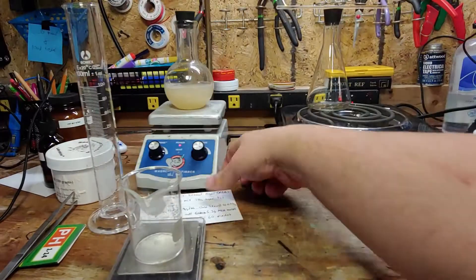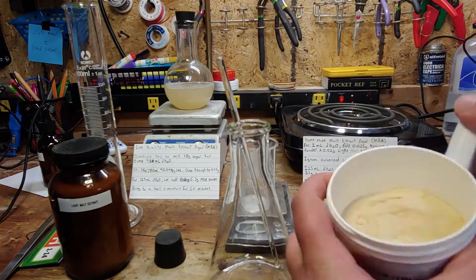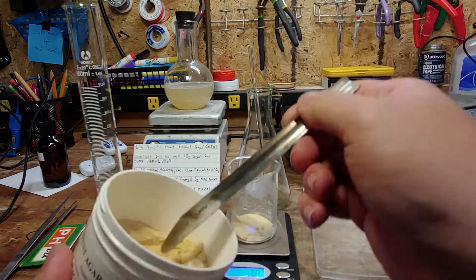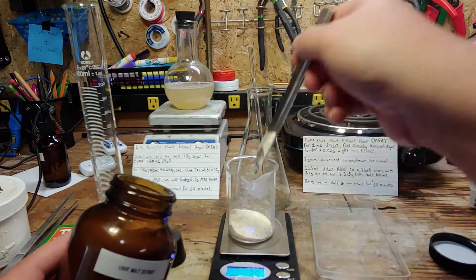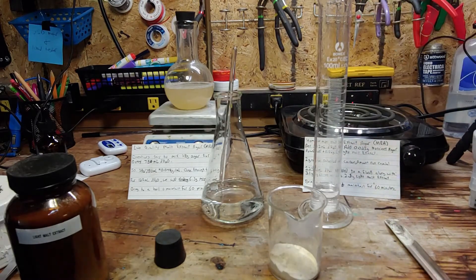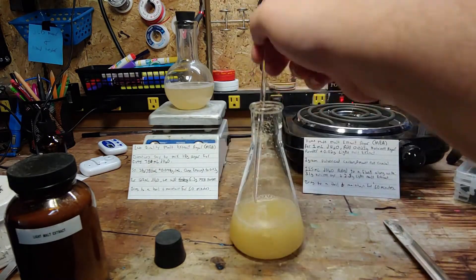Get ready to do another weighing and grab the Erlenmeyer flask. The agar I'll be using in this batch is nutrient agar, which is just what you'd use if you're culturing bacteria or yeast. We also need some light malt extract powder, so the fungi will have some food. Weigh out 3.1 grams of the agar, and then measure out 2.5 grams of the malt extract — 2.7 grams, close enough. Measure out another 125 milliliters of distilled water and pour into the Erlenmeyer flask. Pour the agar as well as the malt extract powder into the flask and stir to incorporate.